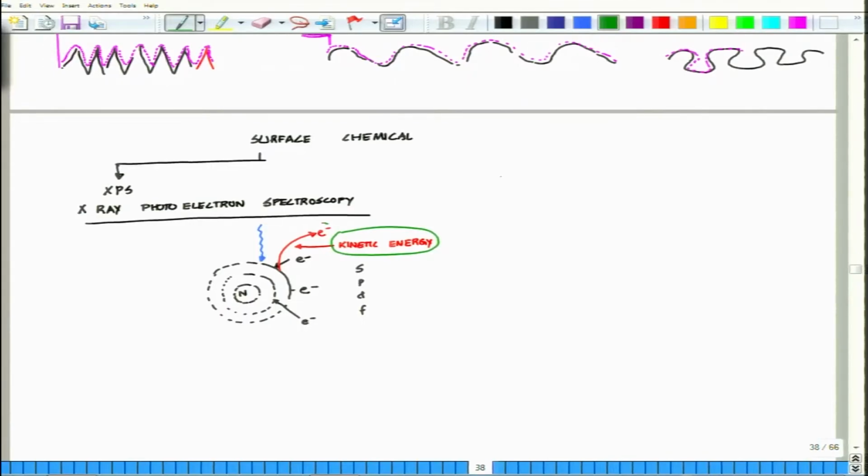So, you could develop a chart depending on the element. Say you have silver, copper, aluminium, iron, sulfur, and in the next column the kinetic energy of the emitted electron of some specific shell, mostly the outermost shell.